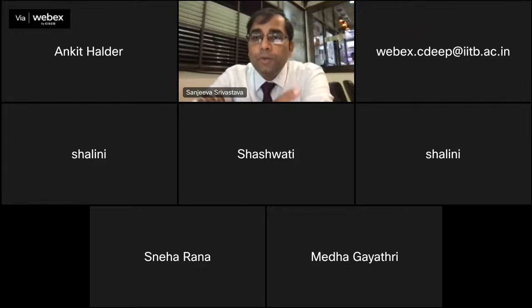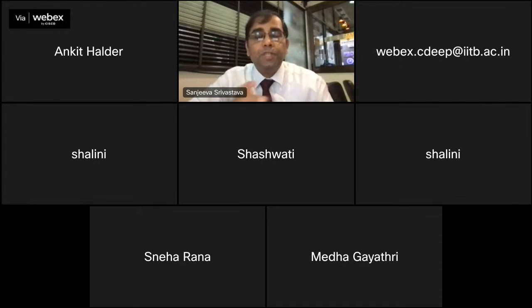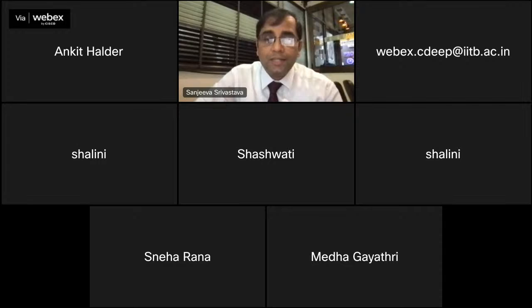Similarly, now you can do these kinds of kinetics of these interactions in 96 well plate format with solution based stuff. And the same solution could also be utilized for your other experiment. And these are some of the powerful points for these technologies, right? While there are always pros and cons of which technology can be more suitable for your applications.